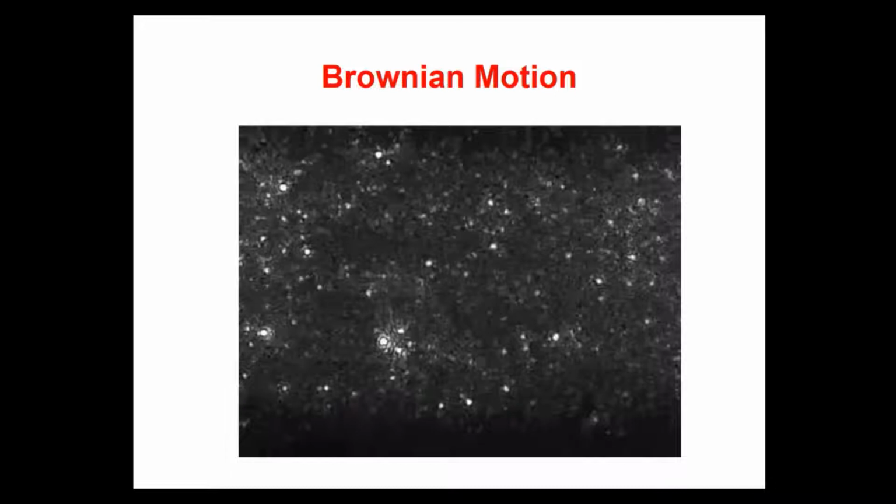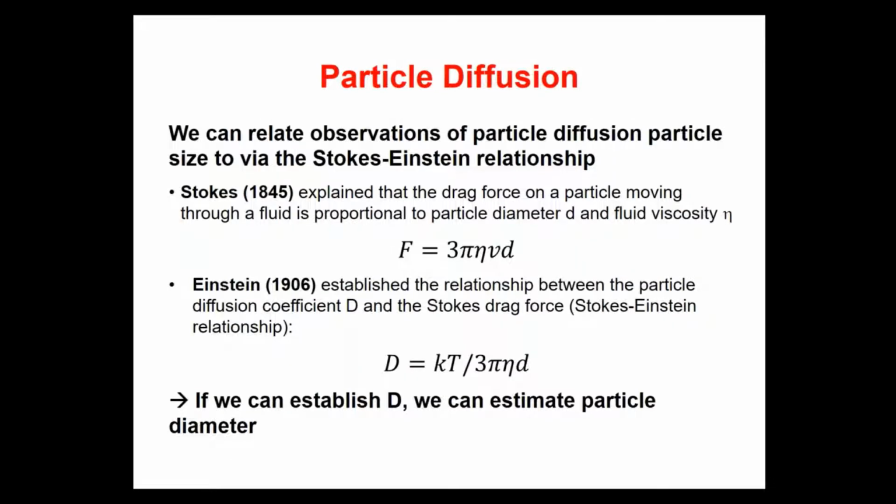You may know that this phenomenon was originally recorded by a botanist, Robert Brown, who observed pollen doing Brownian motion in a droplet of water. But he assumed that the particles were alive in some way. It fell to Albert Einstein to really complete the picture in determining that Brownian motion is due to the random impacts of the molecules of the continuous phase.